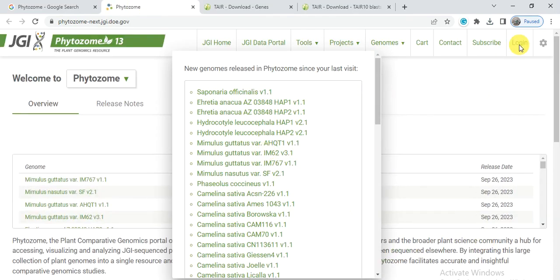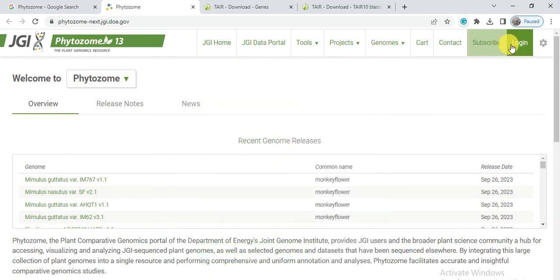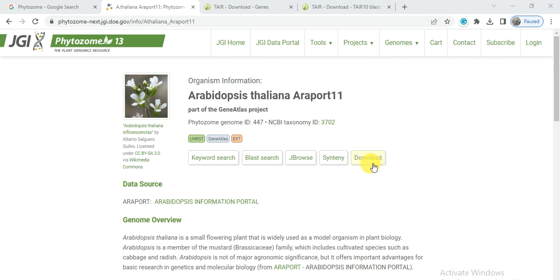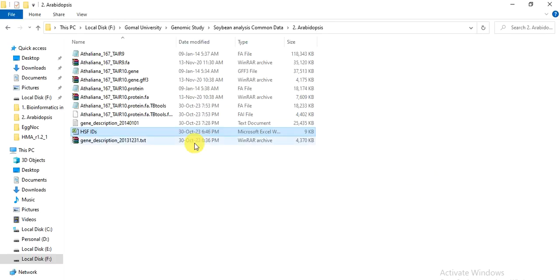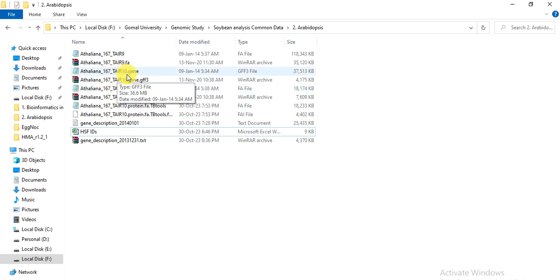To download from Phytozome, first log in, then go to Genome and select your plant species — Arabidopsis thaliana — then click Download and select your files. Now we open our local files: there is the gene description file, the protein file, the CDS file, the GFF file, and the genomic file.